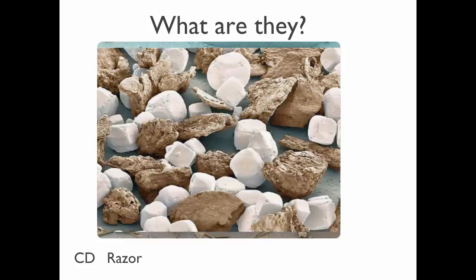Is it cereal? It's not cereal. It is something you eat. Marshmallows? Chocolate? No, this is microscopic, a tiny little thing. It's salt and pepper.